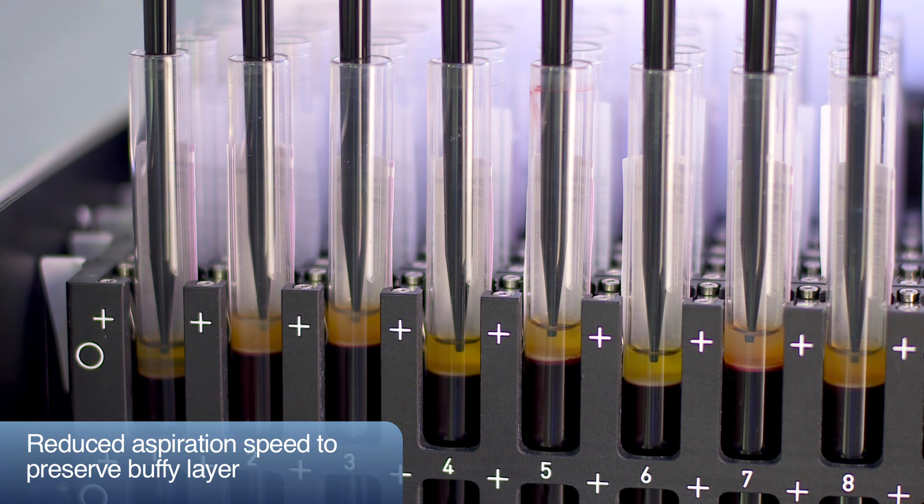A dedicated pipetting step before the buffy aspiration, the so-called last step, reduces the amount of plasma on top of the buffy coat and prepares the actual buffy coat pipetting.